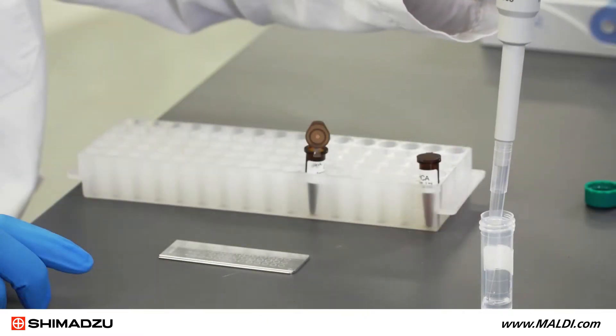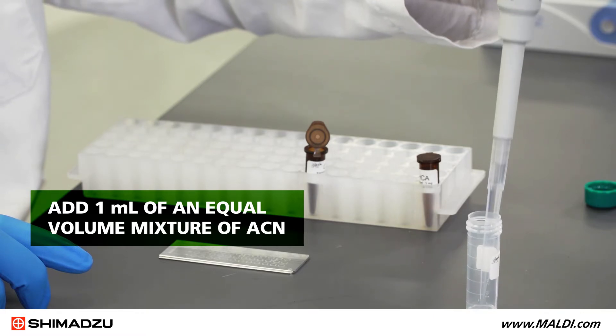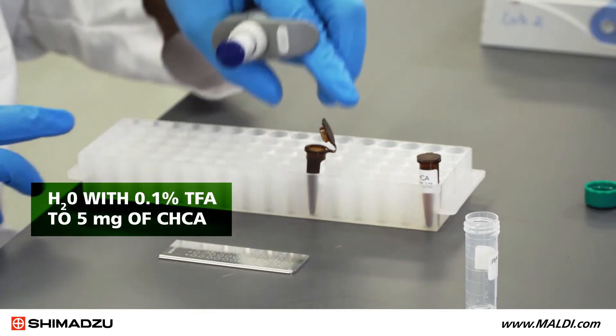To prepare matrix solution number two, add one milliliter of an equal volume mixture of acetonitrile and ultra-pure water with 0.1% trifluoroacetic acid to five milligrams of CHCA.